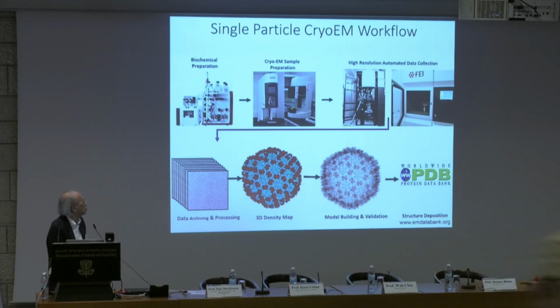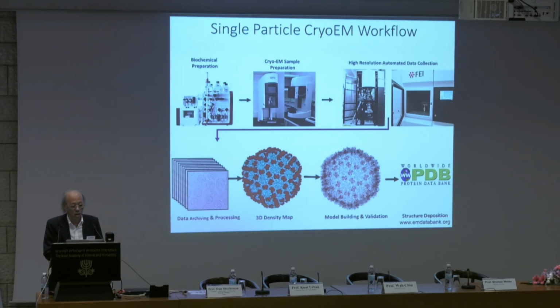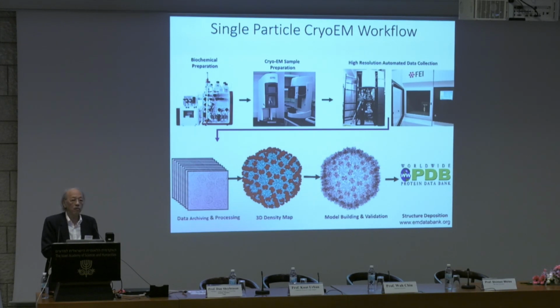for these contributions. And so the frozen hydrated specimen is then put into an electron microscope, similar to the microscope you just heard about a while ago. And since all the biological specimens, unlike non-organic material, are extremely beam sensitive, there are two ways to reduce the damage before we get the pictures. First, we use a very low dosage. In such a way, we zap the picture before the specimens are damaged.